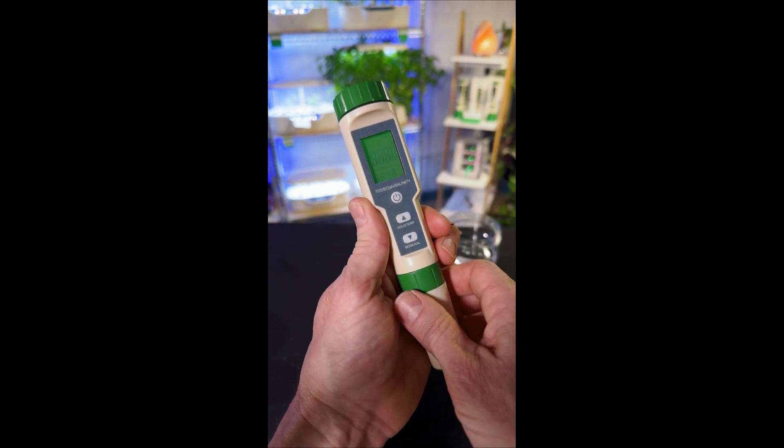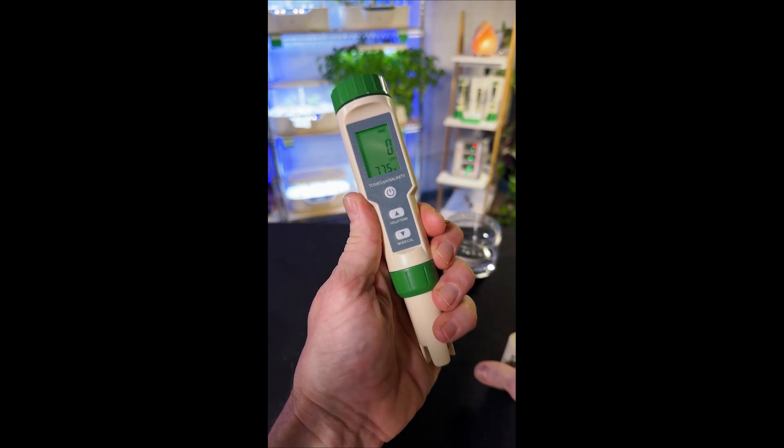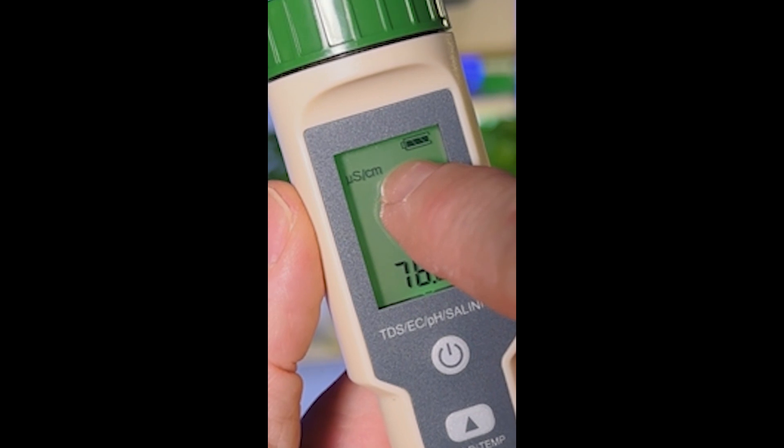Now turn on the meter, remove the cap, and hit the mode button until you're in EC mode.